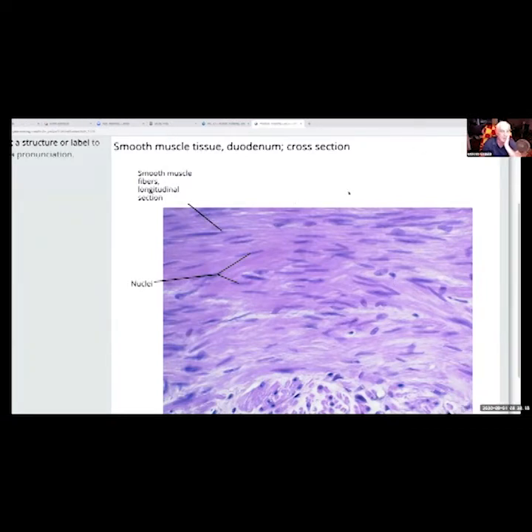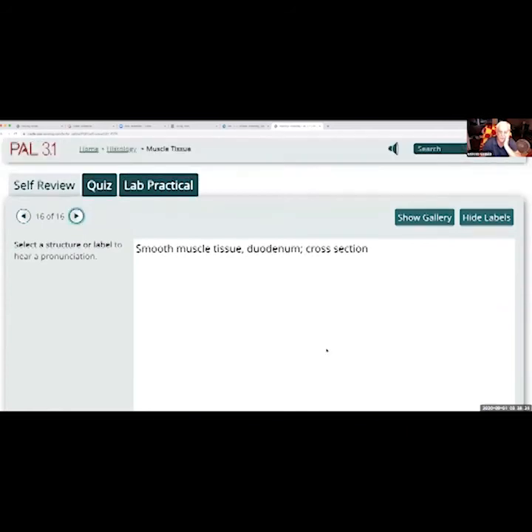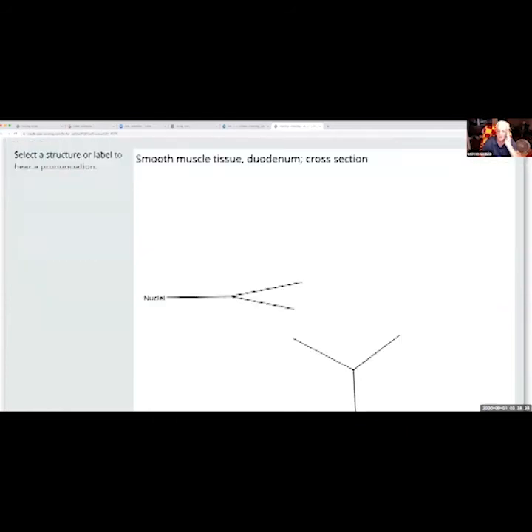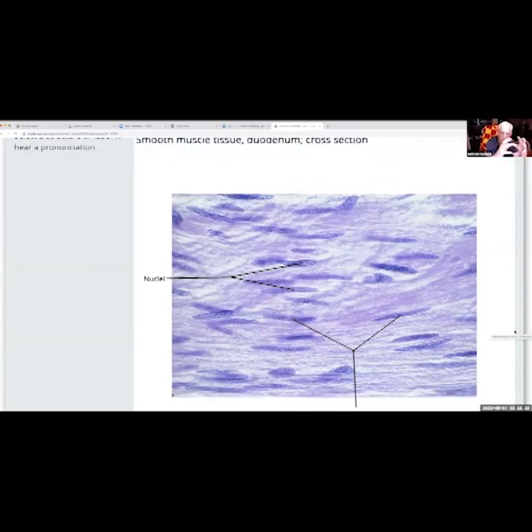Bring this back. Okay. And again, smooth muscle of the duodenum causes peristaltic action. Again, do you see any striations in that? You see a lot of fibers, right? That kind of muscle tissue has to be smooth muscle. There's no striations. It contracts around it like a concentric, like a circular motion. Okay, you can see the nuclei all spread out, and again, no striations.